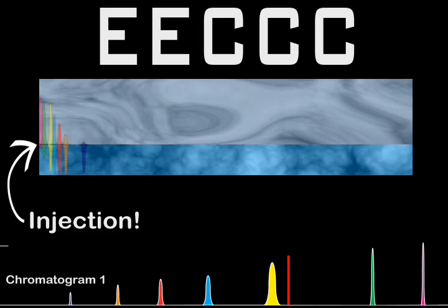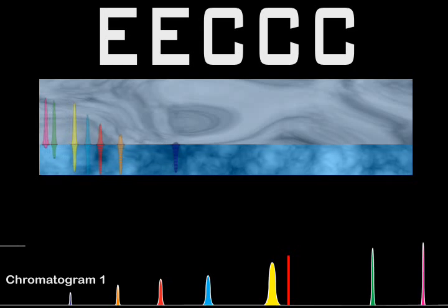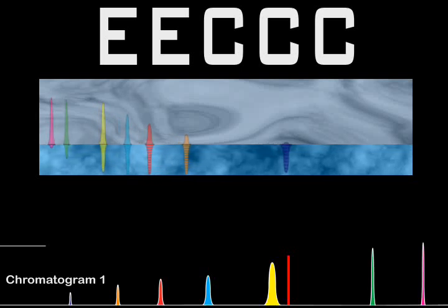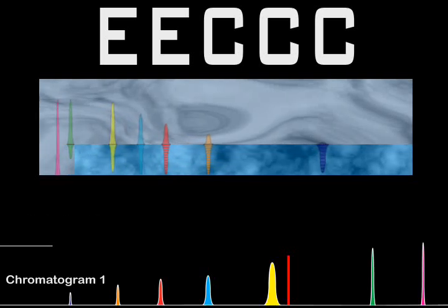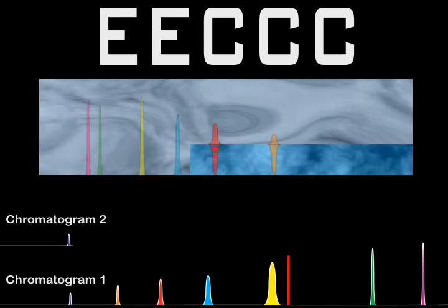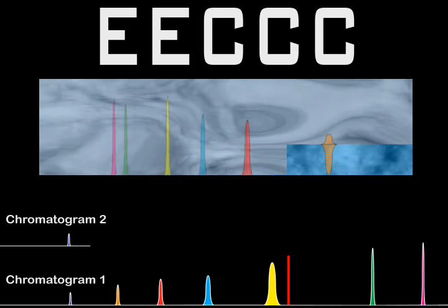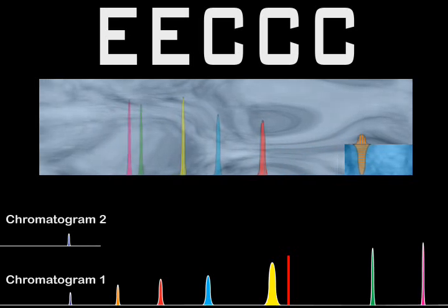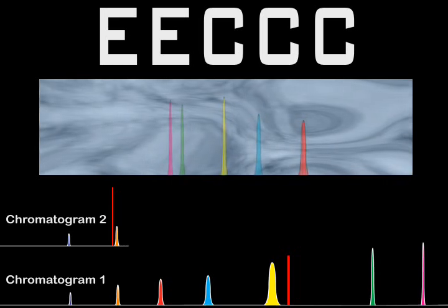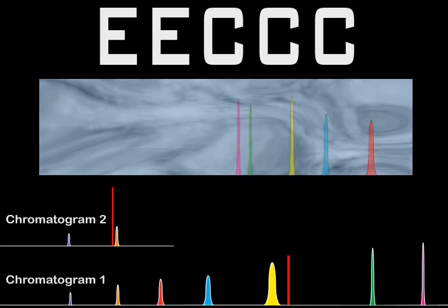Let's try that again, but this time we'll start the extrusion step even earlier. As you can see, we started extruding even before the first compounds have eluted. This is because once the compounds are fully separated inside the column, there's no reason to continue elution — we can just push them out. Starting the extrusion process even earlier this time yields a shorter run and helps keep the analytes in narrow bands.